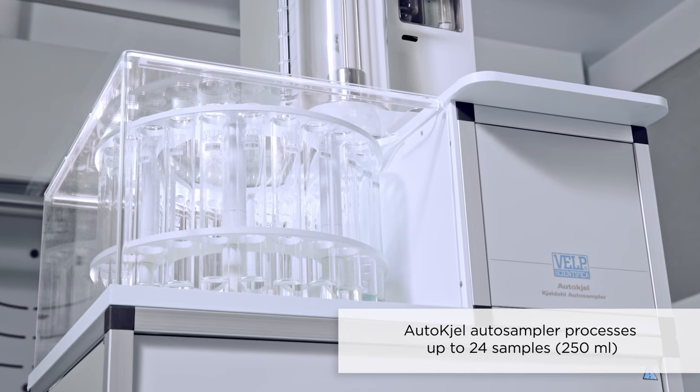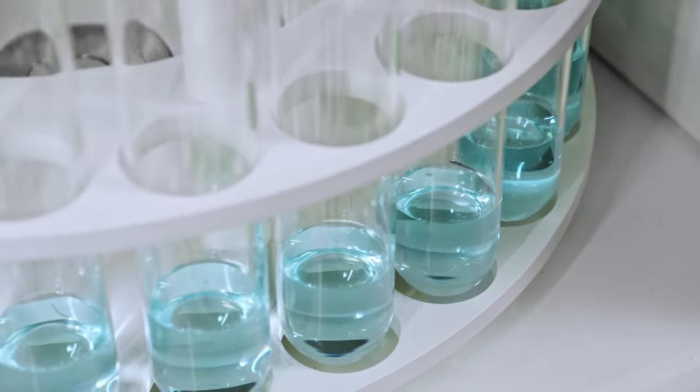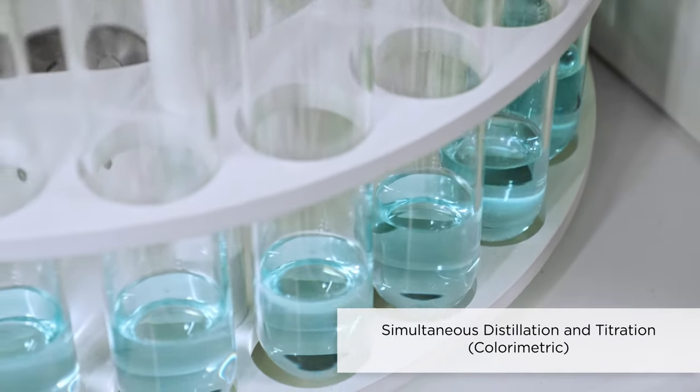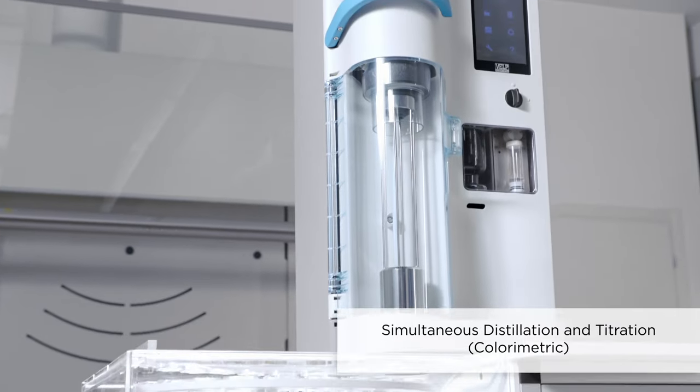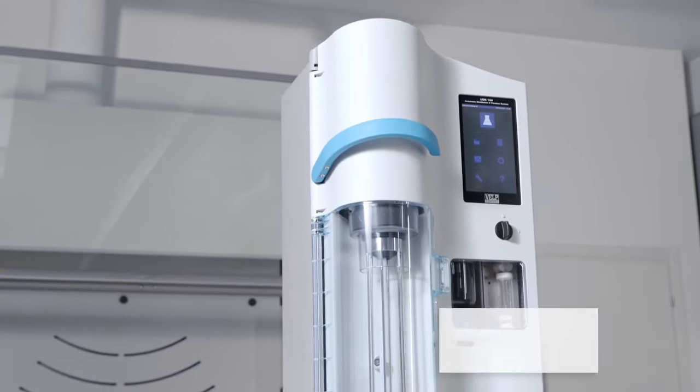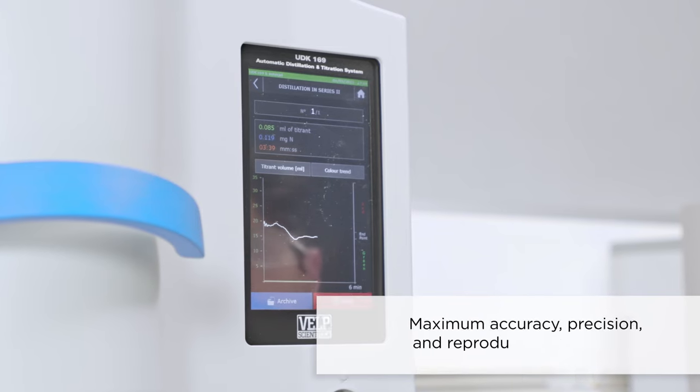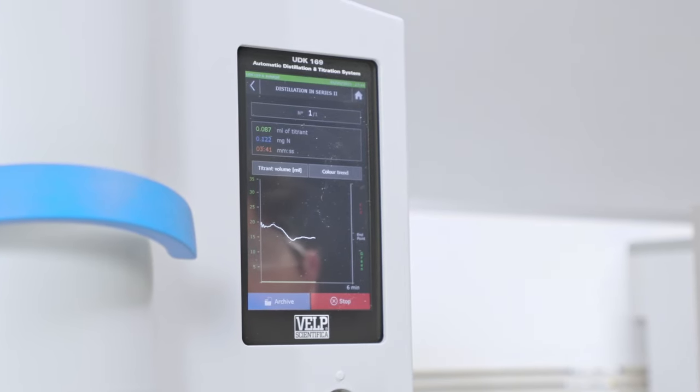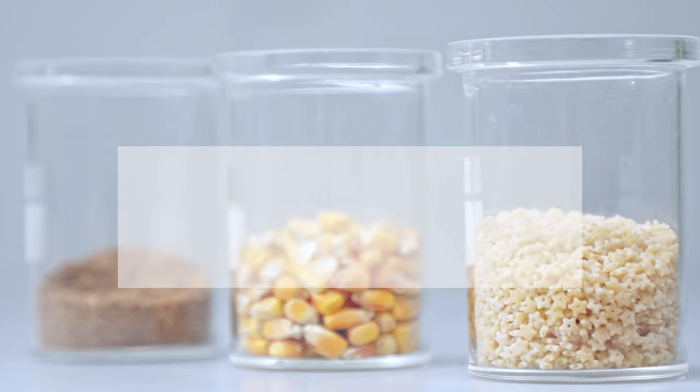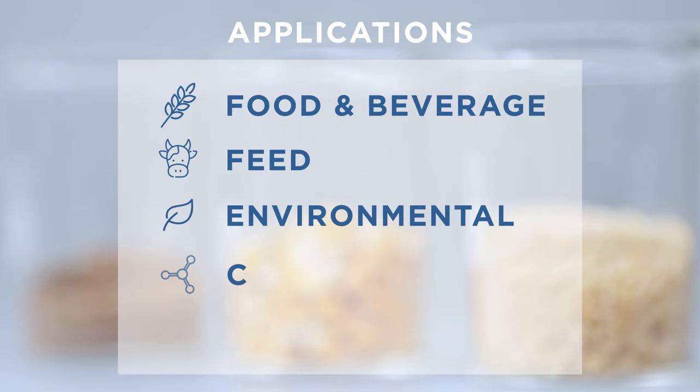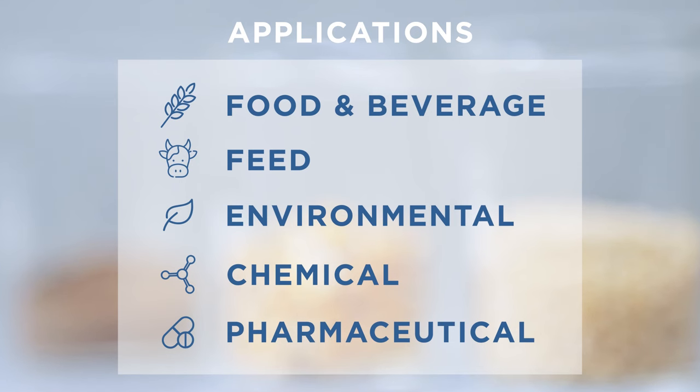In combination with the AutoKjel AutoSampler, it ensures the shortest time to results with simultaneous distillation and titration via an integrated colorimetric titrator. The UDK169 provides maximum accuracy, precision, and reproducibility of results on a wide range of samples in the food, feed, environmental, chemical, and pharmaceutical industries.